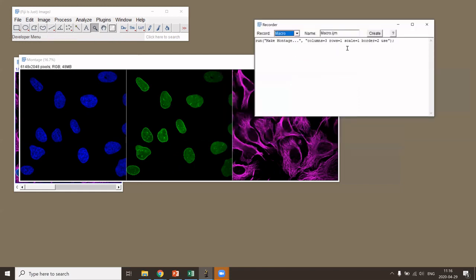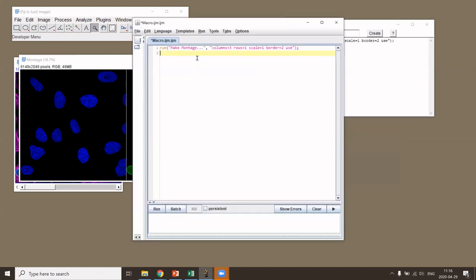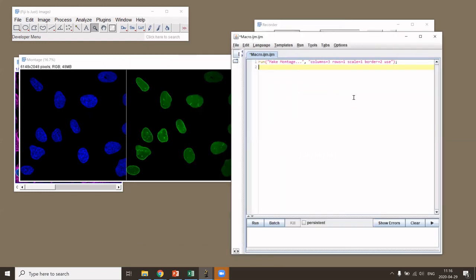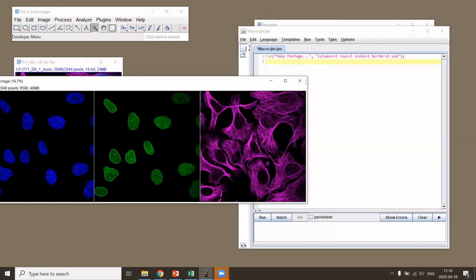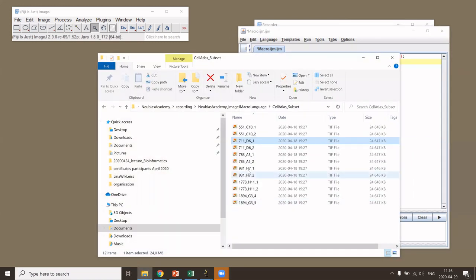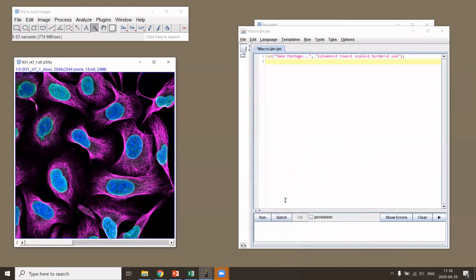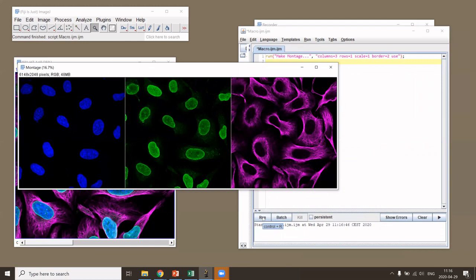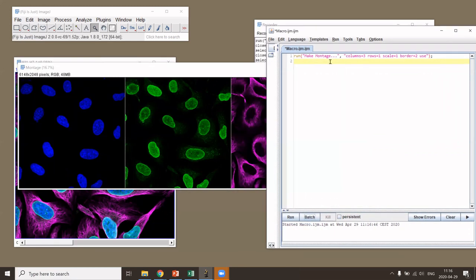You can now press the Create button, and the same command opens up in the Script Editor. What you can then do is open a new image, press Run, and it performs the montage on the new image. Obviously for a single command this may not seem very attractive, but it gets much more attractive as you add more commands.